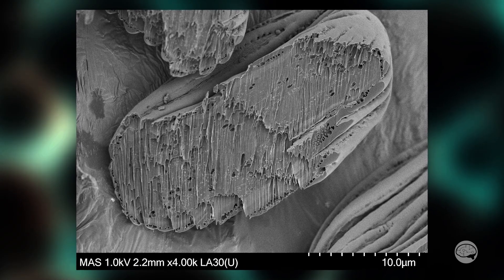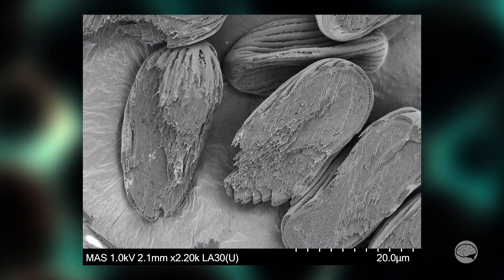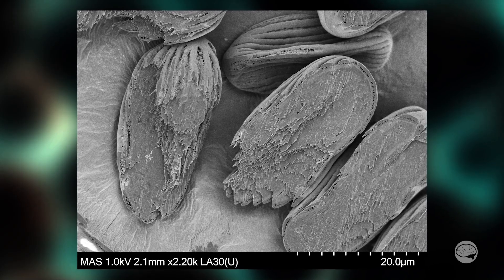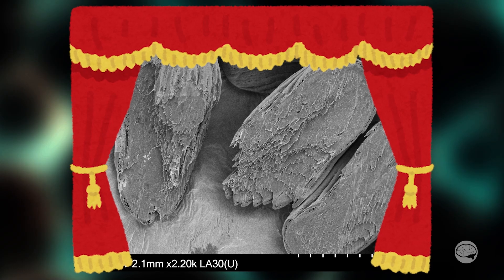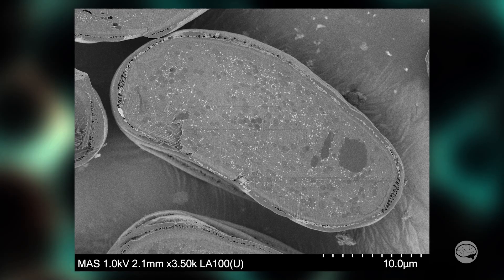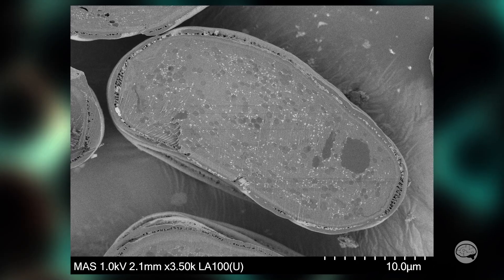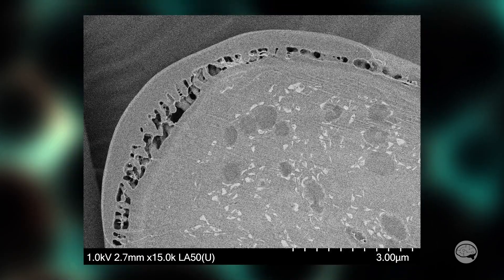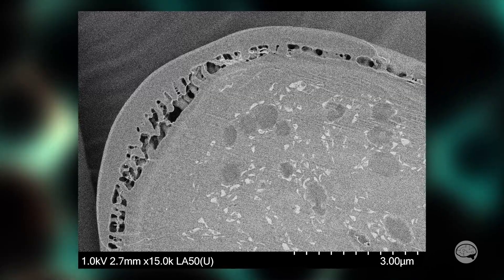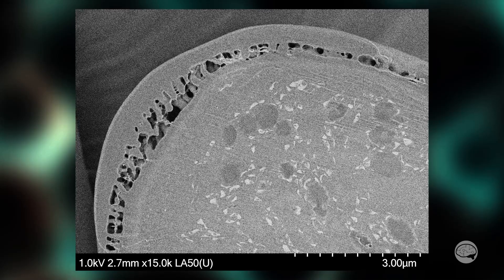Now we can see that because the sample was not flat, most of the structures that were milled do look like a total disaster. And even some of the better ones have a lot of what we call curtaining effects. But through the law of averages or some other miracle, a few of the structures came out looking pretty good. And it's in these mostly flat areas that we can examine what mysterious structures lurk in the heart of the pollen.